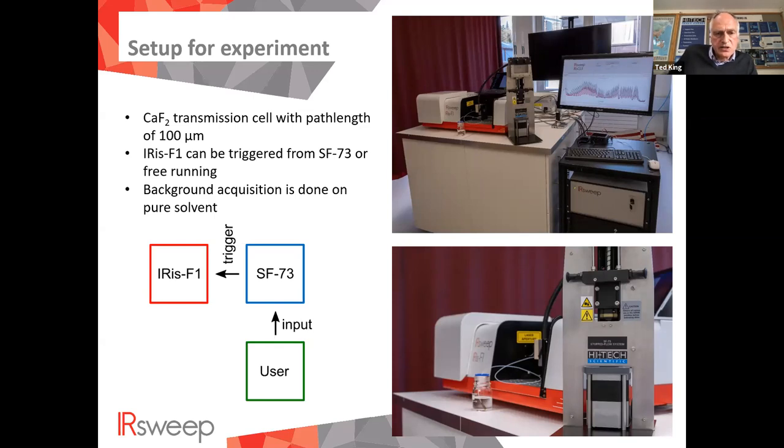The method is that the spectrometer system is set up to acquire data. In other words, it's put in an armed mode with the user then controlling the shot from the application kinetic drive. It does the push, the stop flow does the shot. And at the end of the shot, there's a trigger signal which starts the data acquisition. I'll hand you back to Raphael, who will then take it on from there.